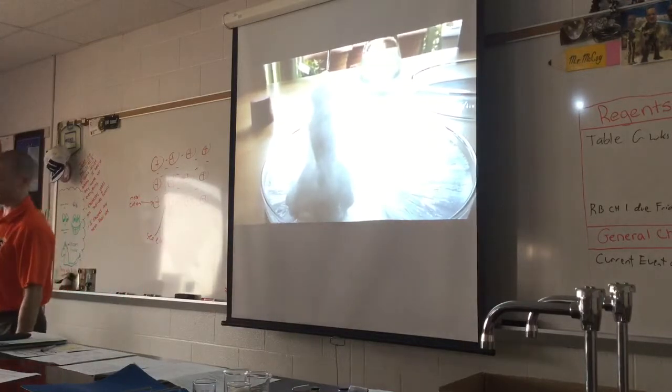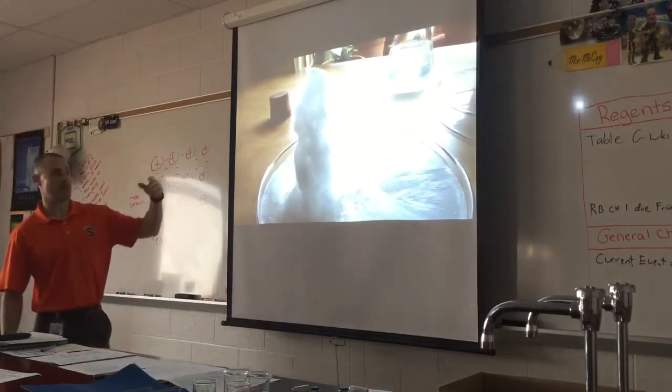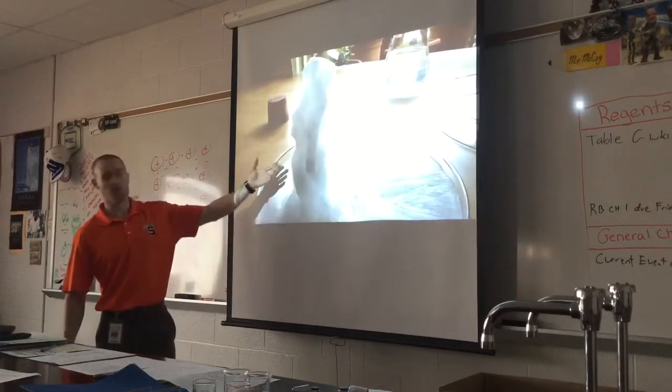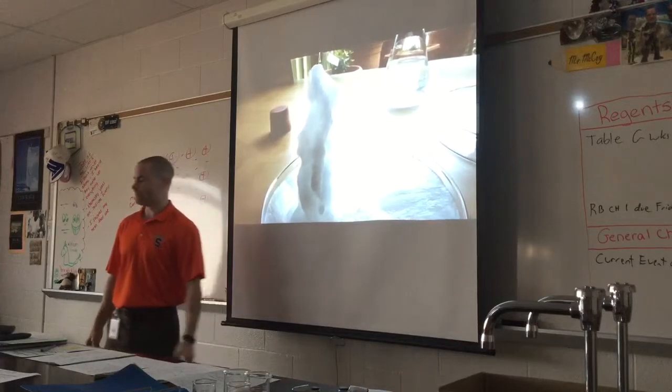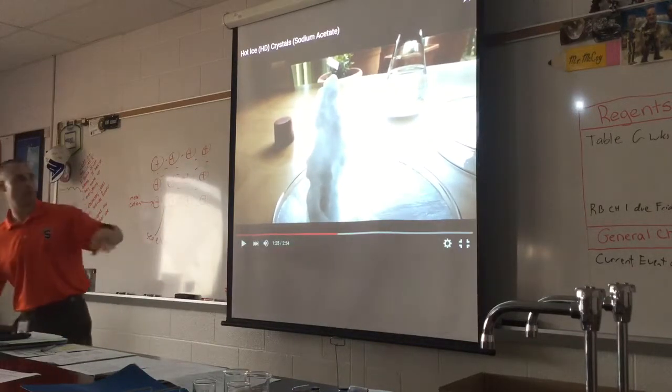It's just too finicky. It's too fragile of a situation. You need a very clean flask. You need brand new chemical. It's very hard to do. And it's just more of that, so I'm going to stop it.